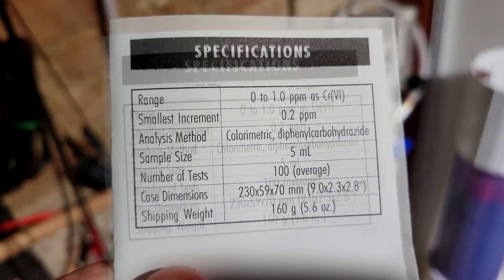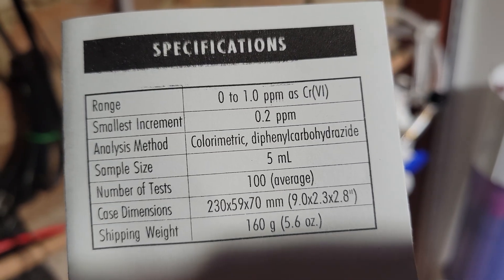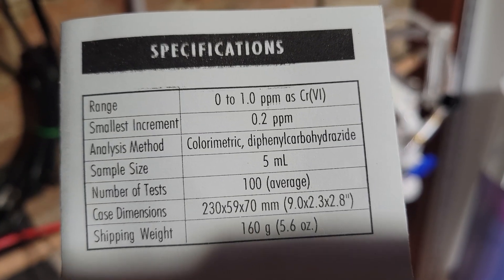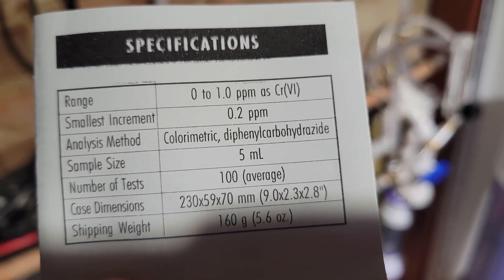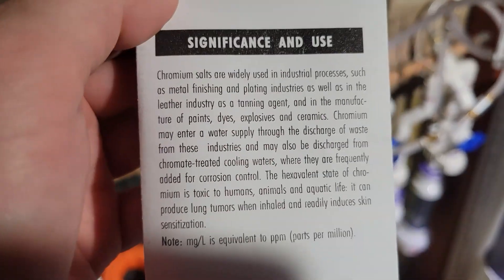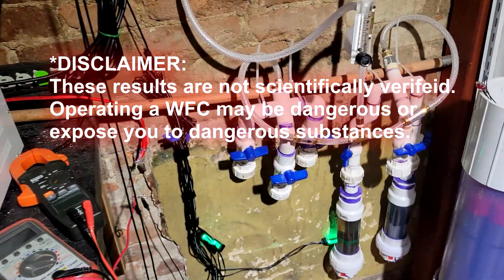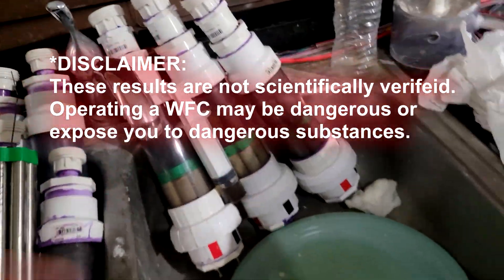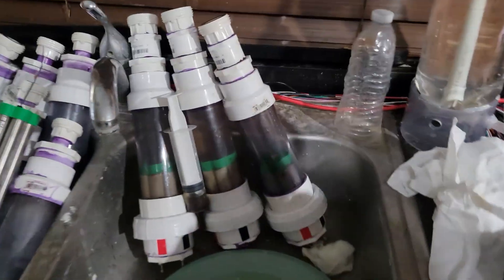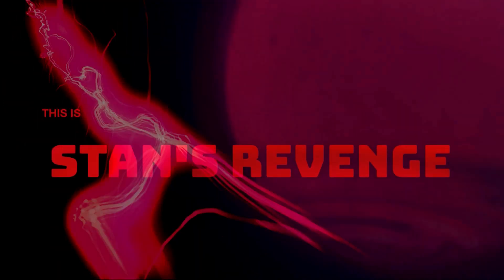Let's look at the specifications here. Smallest increment: 0.2 parts per million. Analysis method is the colorimetric diphenylcarbohydrazide — diphenylcarbohydrazide. This even mentions hexavalent state of chromium and toxic, so I assume this tests for the hexavalent chemical compound. I think this is confirmed. What I will do next is get some distilled water, put it in these things, run it for a good long while, and see what discoloration appears in retrospect to the tap water I have here. I do know the tap water here is chemicalized, contaminated city water. I think that's a wrap. This is Stan's Revenge.